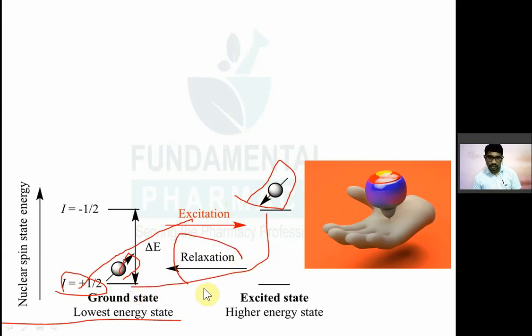We have seen what is meant by excitation, what is relaxation. When will excitation happen? By taking the energy, that is a delta E. So this energy is taken from radio frequency wave. Okay, so ground state, excited state.